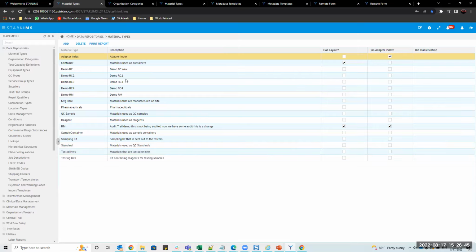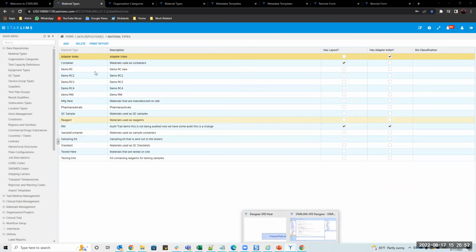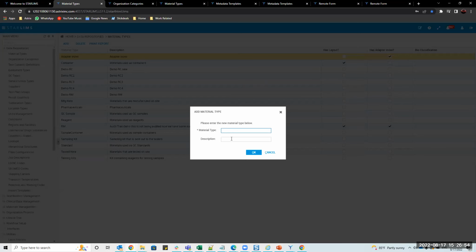And I hit cancel. And now it returns and it's supposed to refresh and do whatever. But sometimes, let's say whatever you did over here is really complicated and it's taking a long time on the server, and you hit OK and it's like nothing is happening and you're just waiting because you have the await and you're just waiting and you're waiting. And eventually this thing returns and you get your new record or something refreshes, whatever. In the old way, that was the way. You had no other choice, right? You didn't have this option. You didn't have any other options.